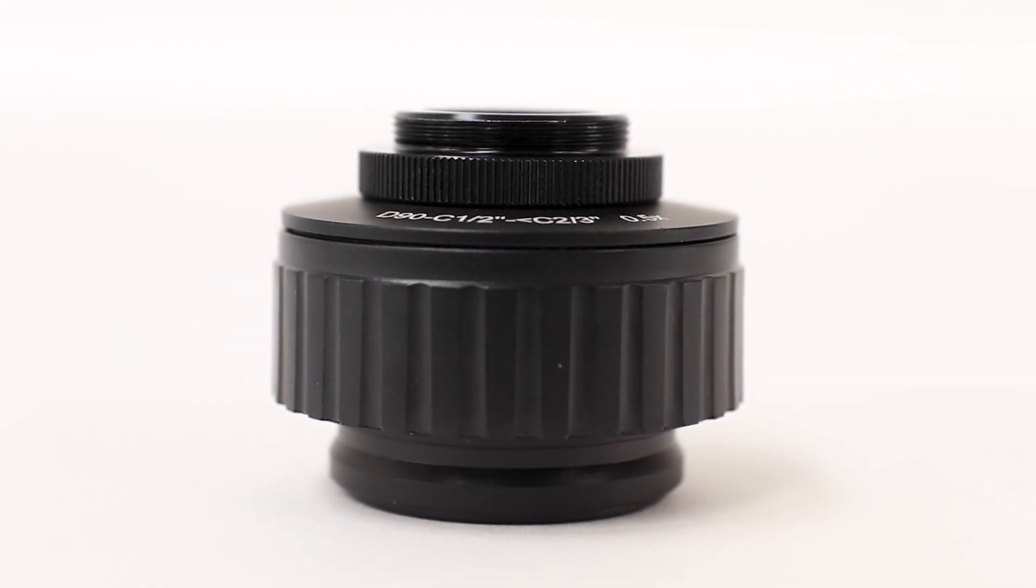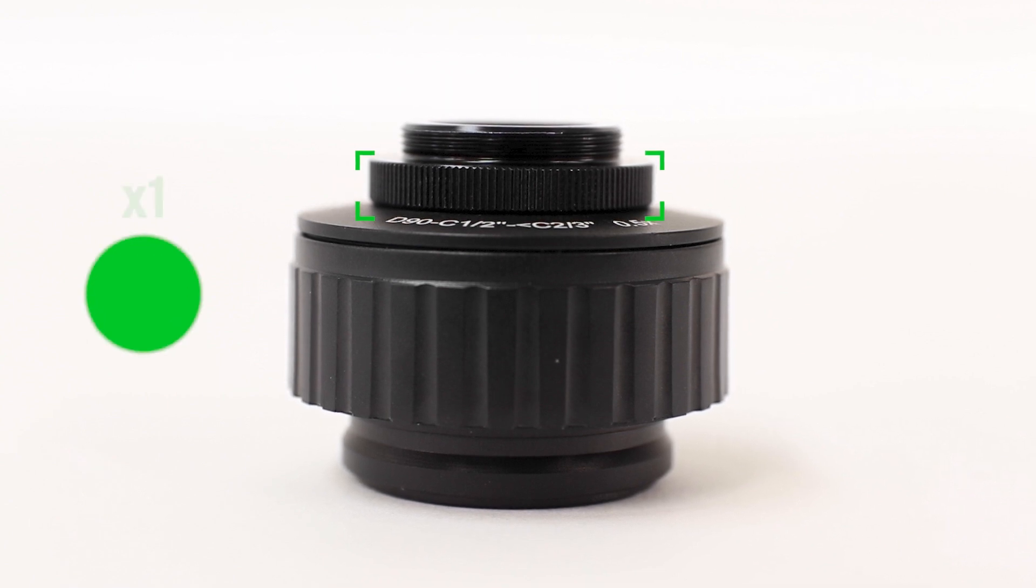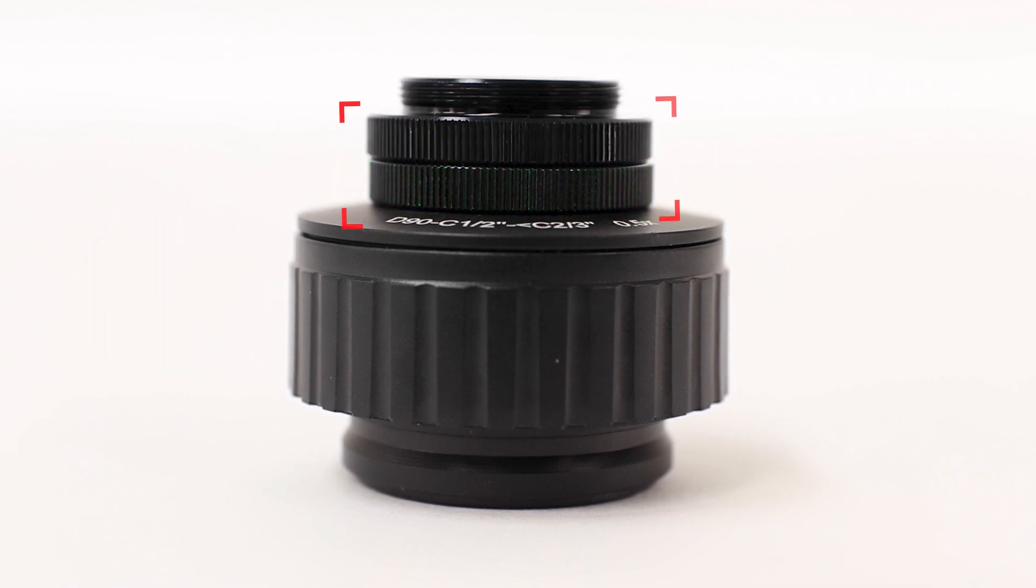Motic C-mounts usually come with a CS ring attached and the camera package includes another one. Make sure only one CS ring is mounted when attaching the camera.